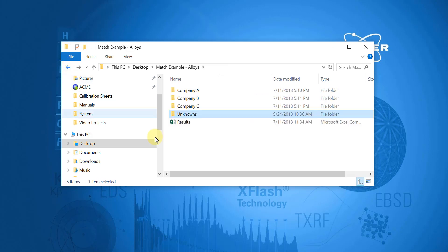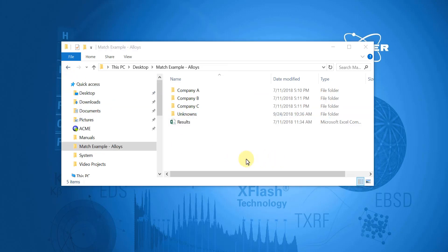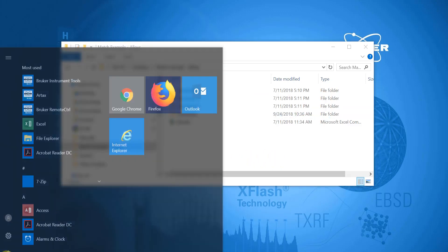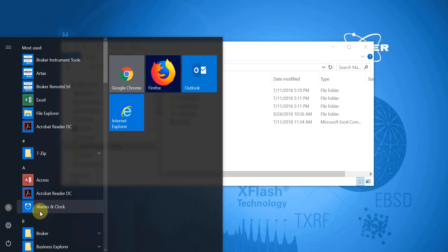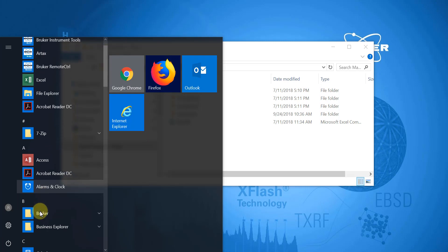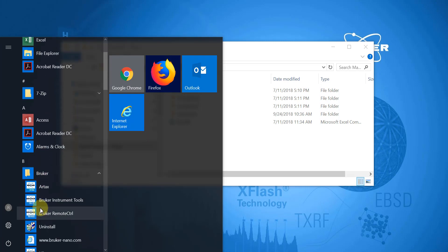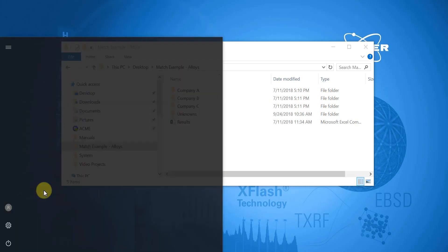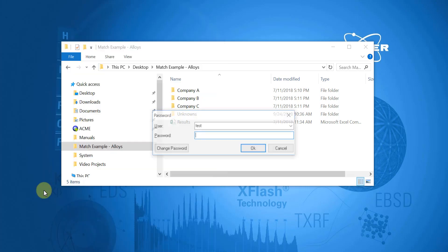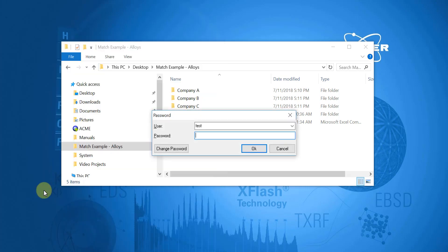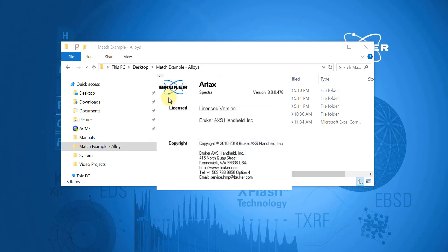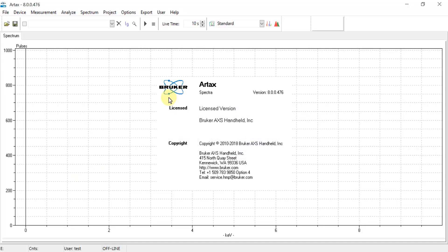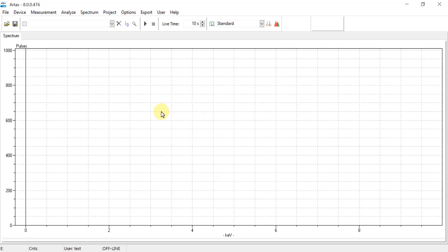Next we will open RTACS, and this is located either on the desktop as a shortcut icon or it's in the main Brooker folder. Both the username and the login password are both tests. And the first step in RTACS will be to open the first group of PDZ files. So in this example, that will be for company A.